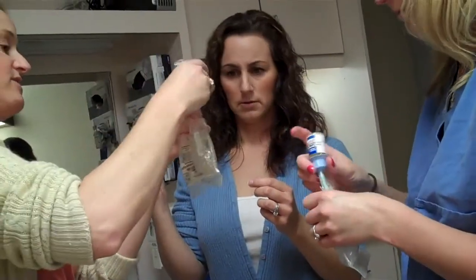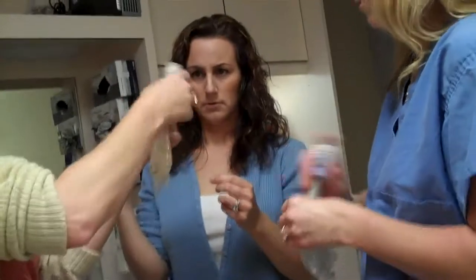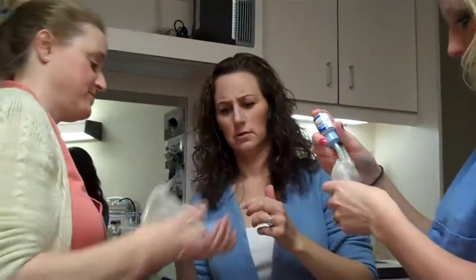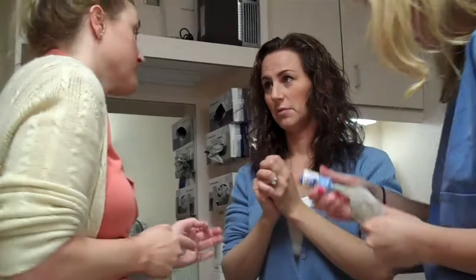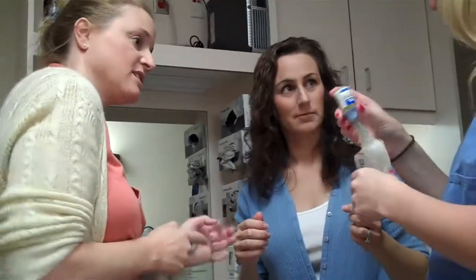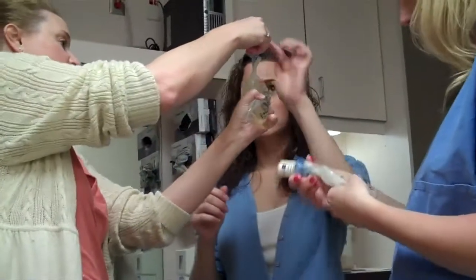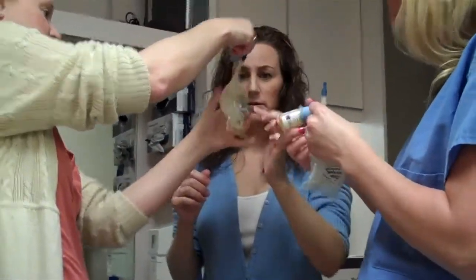That's not a very good breaking seal. Ah, there we go. You might have to break that seal a little bit. It's yellow. So you just push. This powder can be tough to dissolve. Does it just clump the minute it gets wet? Yeah. Almost all there. So the idea here is just to make sure that all that powder got wet and went into here. So I want you to try it.